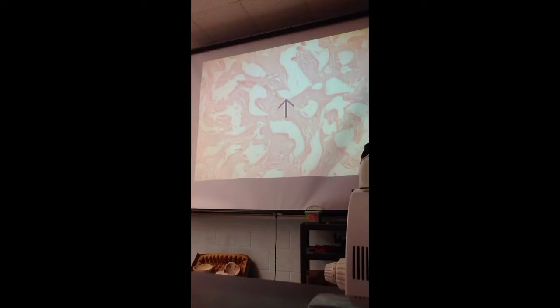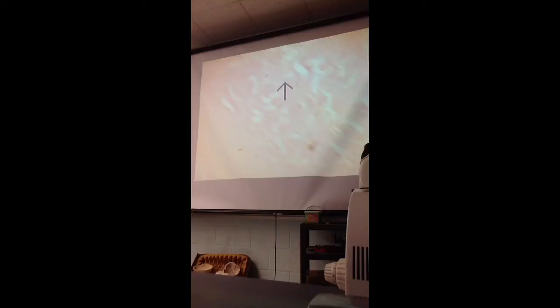So this is kind of an inverted U. Above the corpus spongiosum, you have two large spaces, one on one side, another on the other side. Corpus cavernosum. This is white space where blood can be filled. It also has some connective tissue, trabeculae. Corpus cavernosum. And the wall around, the tunica albuginea, is the thick fascia, and on the exterior you have the skin line. Right?